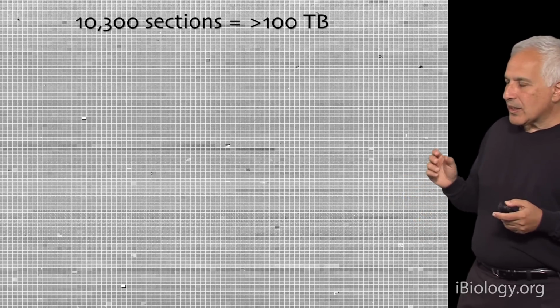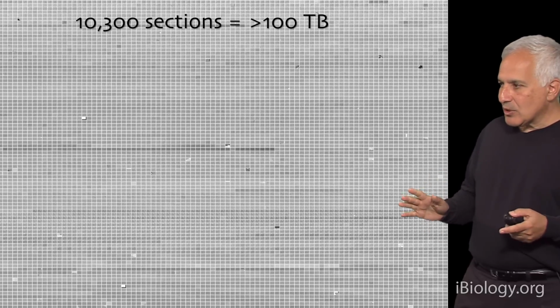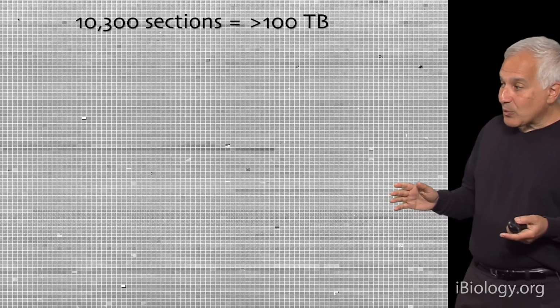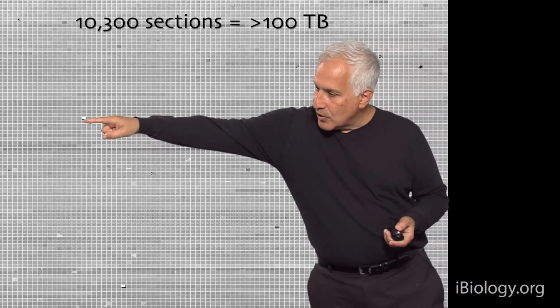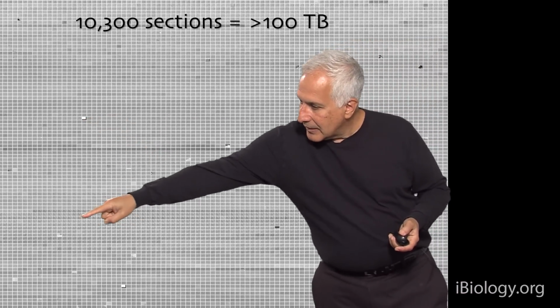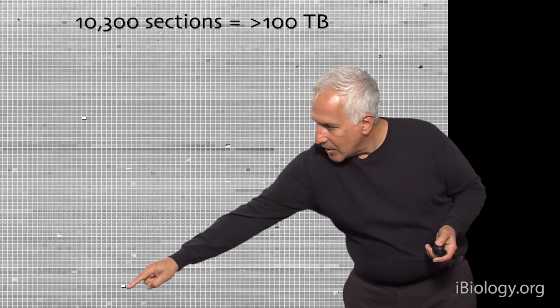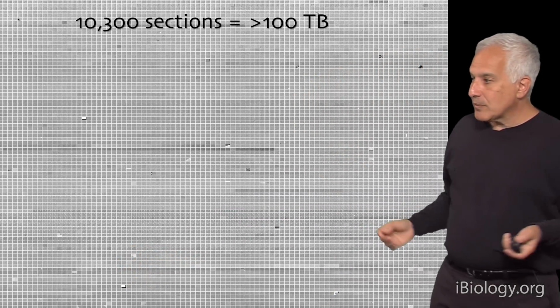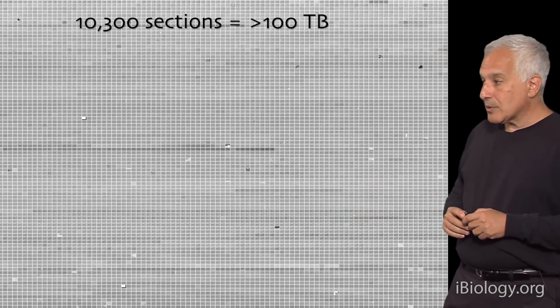And one of the things you can see is that the quality of the machines we're using require that they work minute after minute, 24 hours a day, 7 days a week, and never fail. And in fact, when you're taking that much data, occasionally they do. Notice, for example, this image here, and that image there, and maybe that image there, where there's no image. And this is because occasionally the machine would shut down for inexplicable reasons.